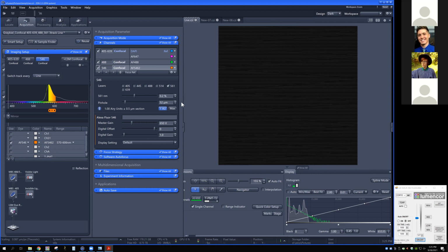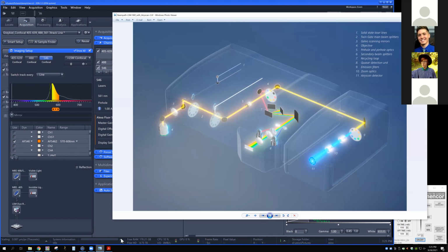All right. Okay, so let's go back to the Airy Scan then. And just to show you that light path once more really quickly: if we're sending everything to the Airy Scan, then we are basically letting all of our emission come back through. It's worth mentioning that the pinhole in this case is going to be wide open, because that conjugate image plane is the same for the pinhole, and your specimen focus is a conjugate image plane that's shared by the Airy Scan as well. And so effectively the Airy Scan is your pinhole. It's just a pinhole with 32 different detectors that are all 0.2 Airy units in diameter. And so the pinhole is wide open.